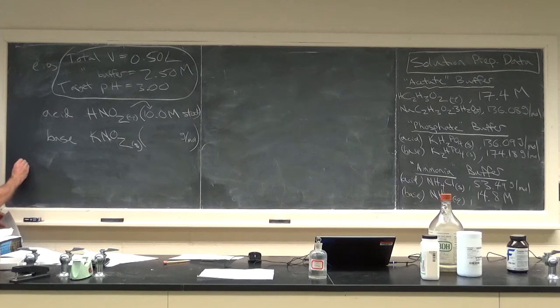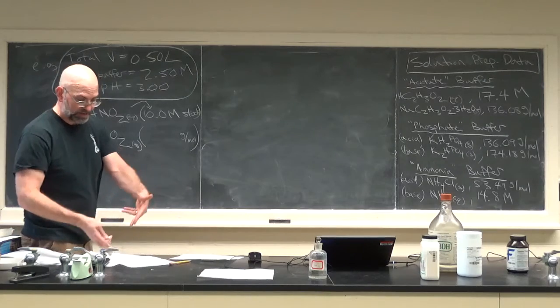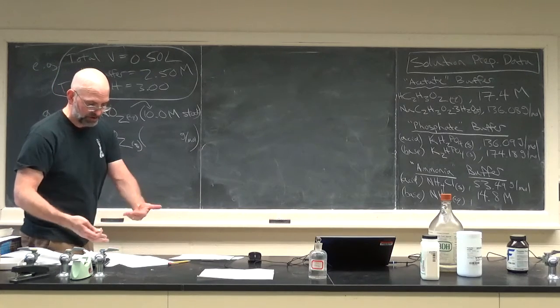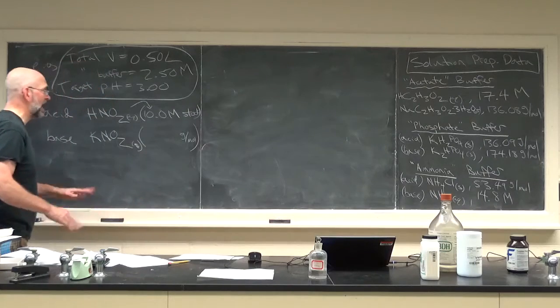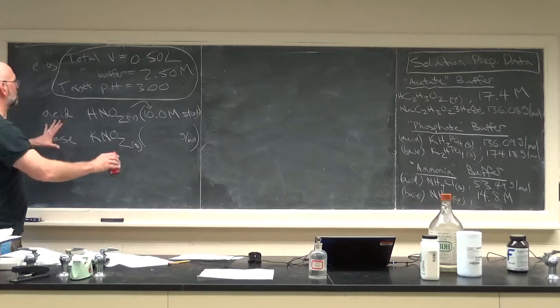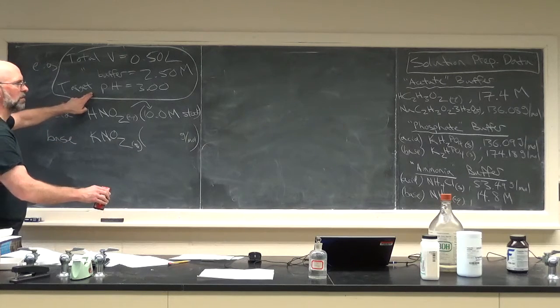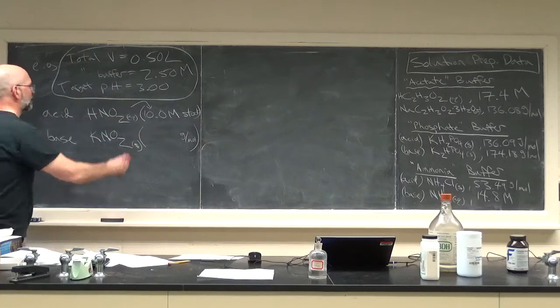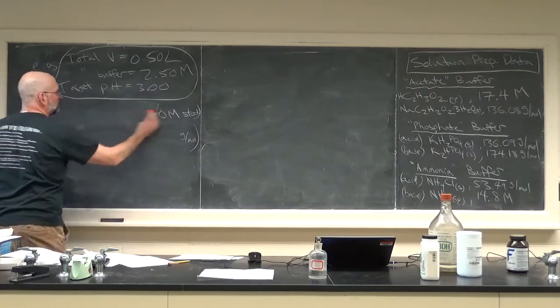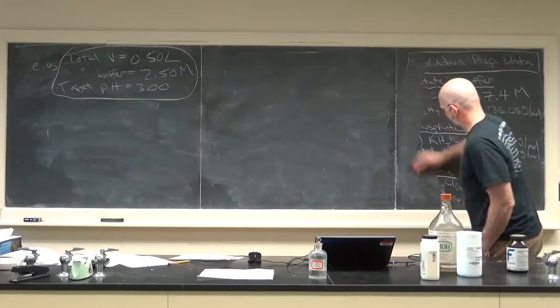And we know our pKa, we have it from before, is 3.39. So if you want to just read the manual and repeat the calculations that are shown there, go ahead. I'm going to do all of that, but I need all this space. Except I want to leave this. And I don't need any of that anymore. Okay, all right, so let's do the math. Let's make some space and not be confusing.